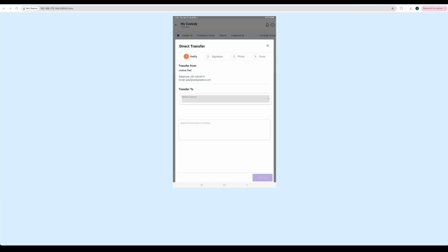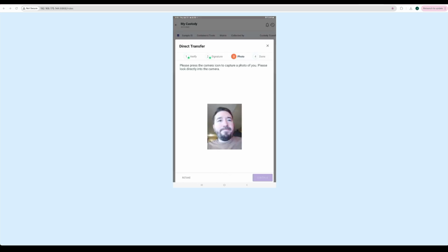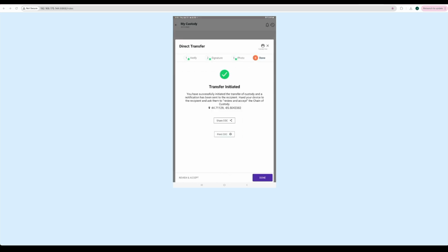For TCEQ projects, we're going to select David Weber in the Transfer To dropdown in order to get to the next screen. Whomever you pick, it does not matter for this use case, since we're sending our chain of custody a different way later in the process. Tap Continue. You will then sign and selfie like before. Once we reach the Transfer Initiated screen, we have a few options.